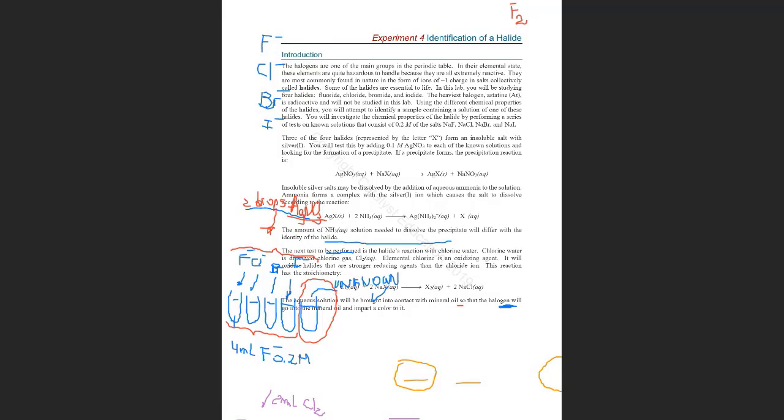So if the chloride went from 0 to -1, it went to a lower number, which means that the chlorine water was reduced.